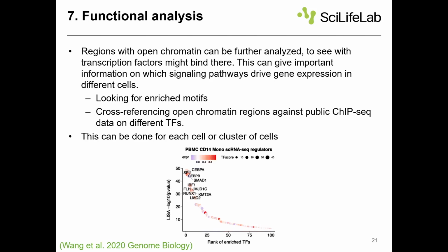So this you can typically do. You can, for example, look for peaks that are specific to a certain cell type or to a certain condition, or any set of peaks you're interested in.